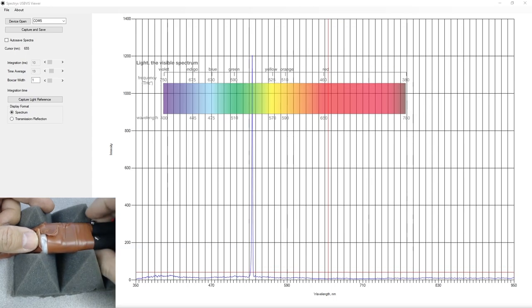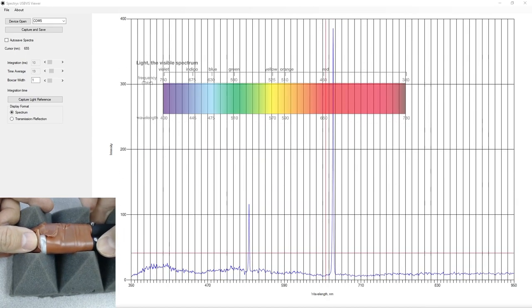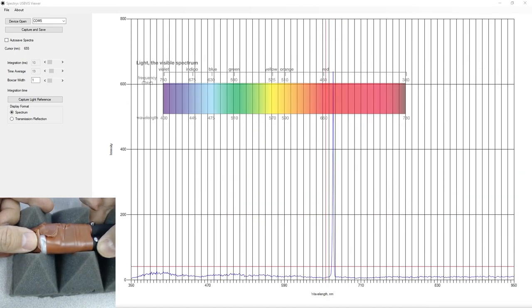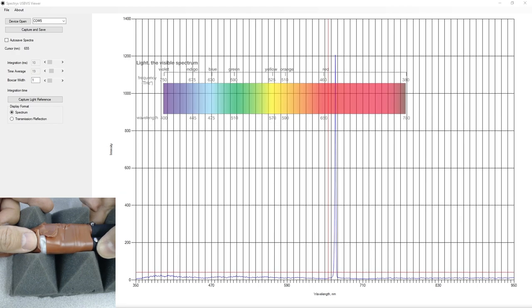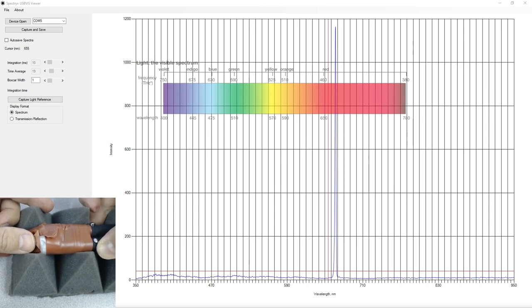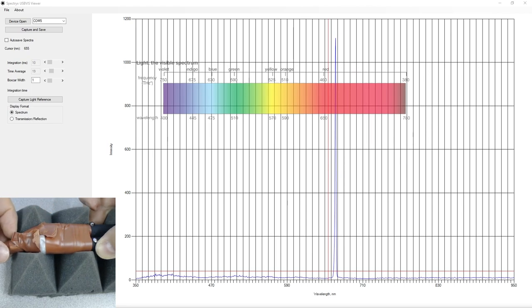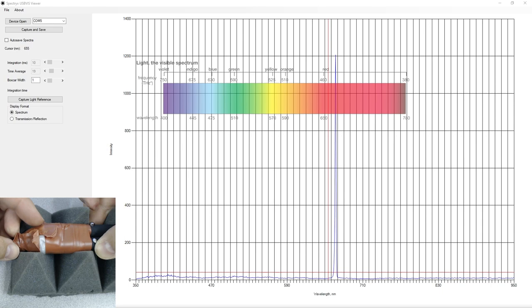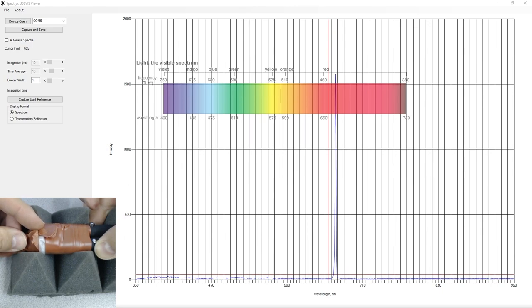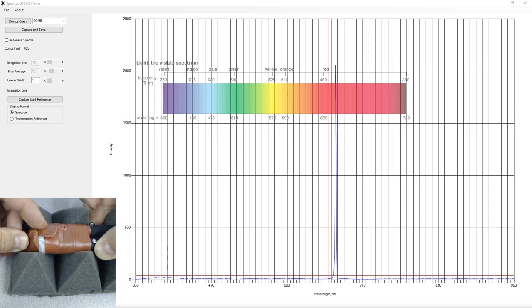And we're going to try and hit the blue button. This is the red button, rather. It's a nice, clean red. Look at that. It's going up to just 1,200 samples. Now, if I move this head around, it'll either look at more or less of the red that's being bounced around in that sort of styrene, expanded styrene packaging. So there we go. So we're reading about 2,000 there.